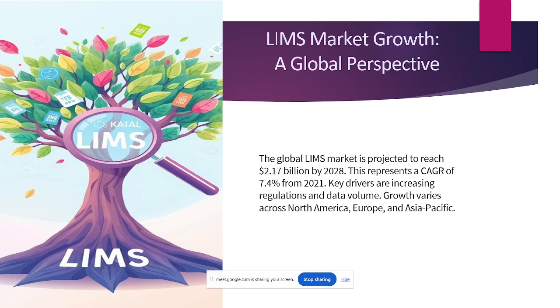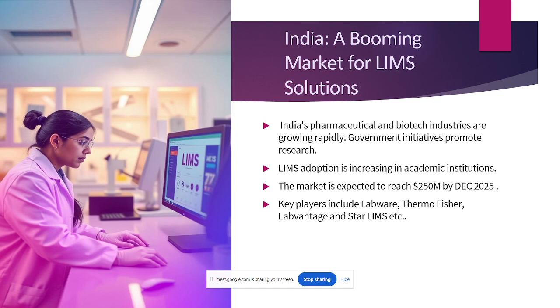Right now, 50% of companies have already acquired it, and they are doing their workflows and operations in the LIMS application only, either LabWare, StarLIMS, whatever it may be. So LIMS adoption is high in the market right now. That's why we can see more opportunity in LIMS, and people who have knowledge of LIMS have a better future.